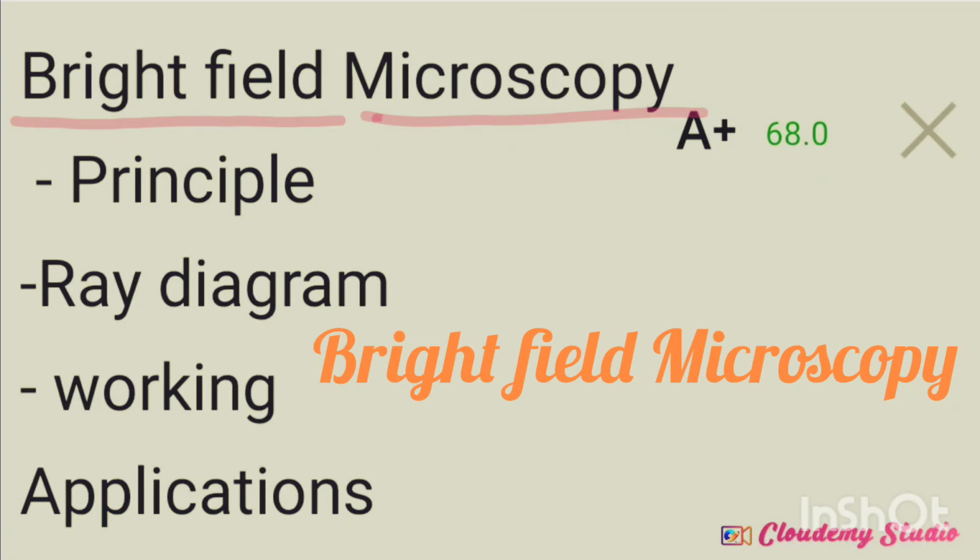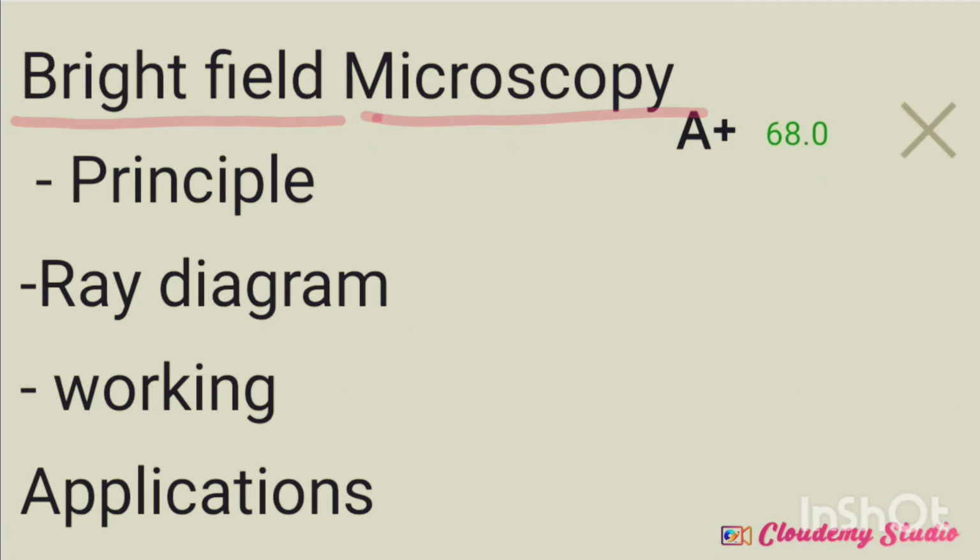Hello students, in this video we are going to discuss bright field microscopy under the headings Principle, Ray diagram, Working and Applications of bright field microscopy one by one.